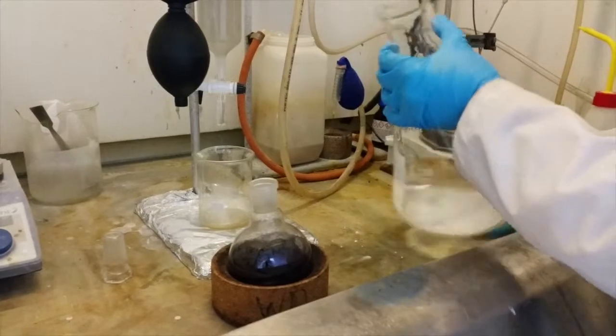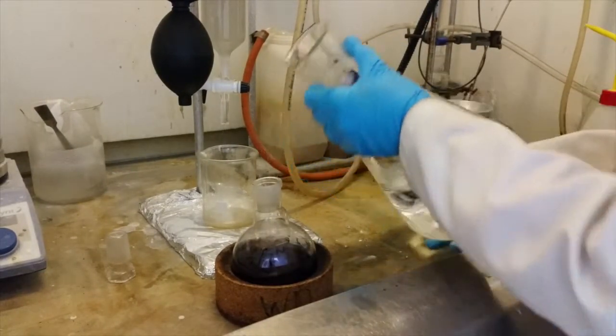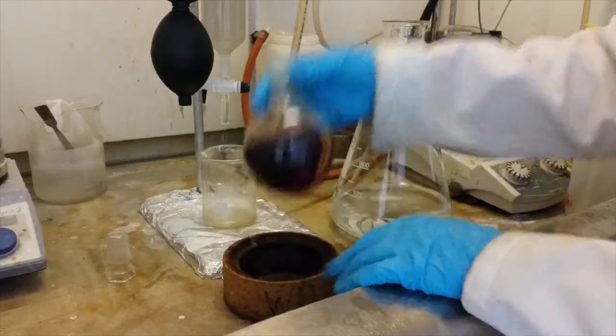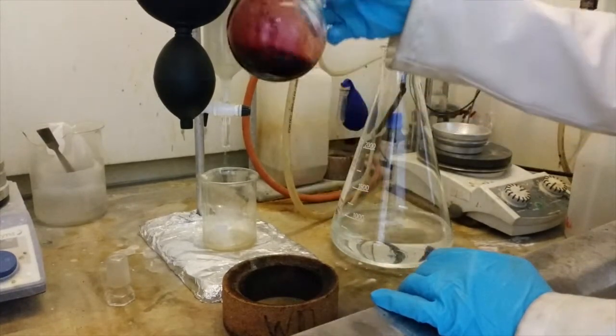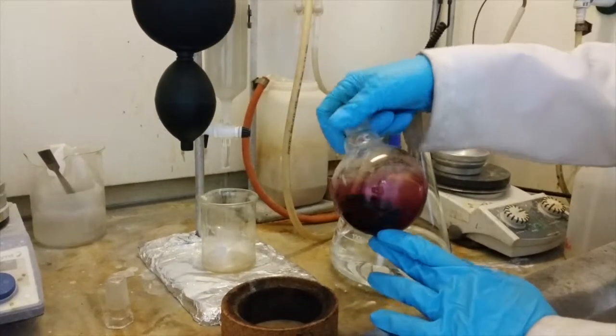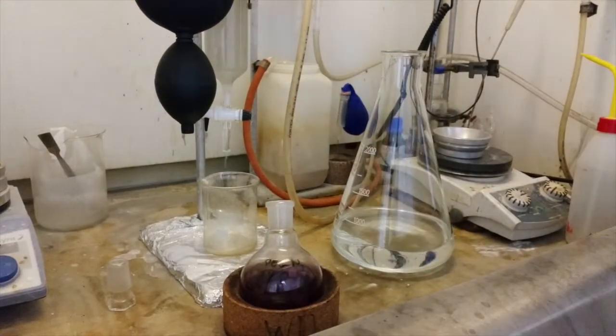While your column is running you need to prepare your crude sample. In order to do this you need to dissolve it in the minimum possible amount of the solvent that you're using. Make sure that you use enough solvent to fully dissolve your crude with no solid product remaining. However being sparing with your solvent use now means you'll get a better separation on the column later.